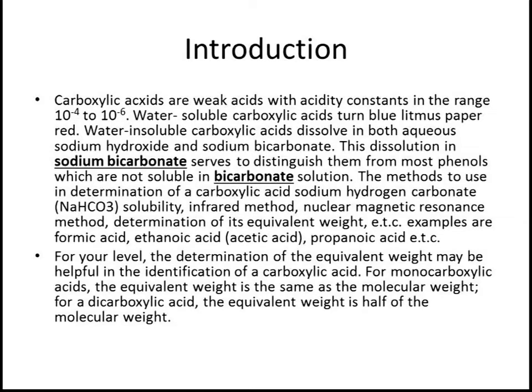Carboxylic acids are weak acids with acidity constants in the range of 10 raised to the power -4 to 10 raised to the power -6. Water-soluble carboxylic acids turn blue litmus paper red. Water-insoluble carboxylic acids dissolve in both aqueous sodium hydroxide and sodium bicarbonate. This dissolution in sodium bicarbonate serves to distinguish them from most phenols, which are not soluble in bicarbonate solution.